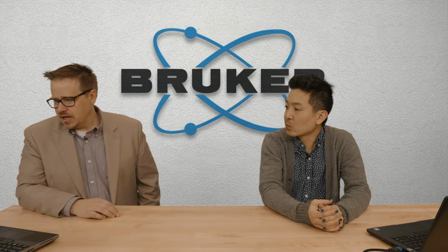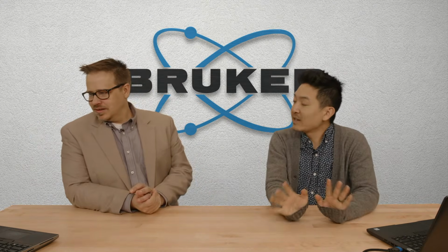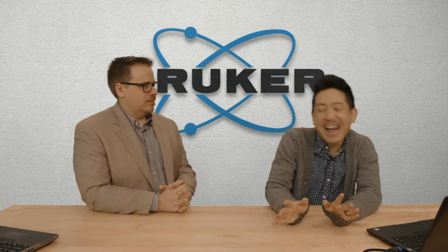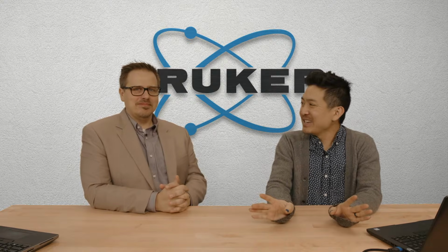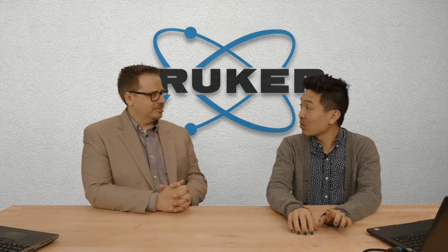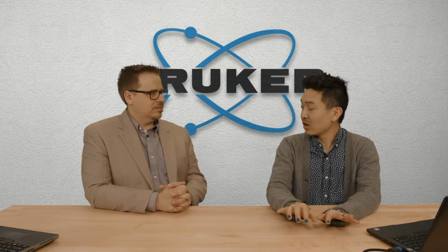Kodaswara: How to access the PDF4 plus 2022 file? So you can go to icdd.org. I can't remember. Just Google ICDD, the International Centre for Diffraction Data. They've got a great website. It's searchable, so if you're looking for a specific material, you can search for your material and it will tell you which of the associated products are there.